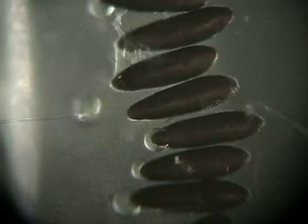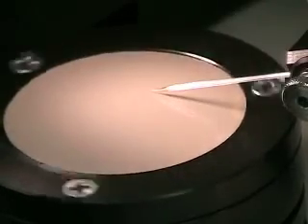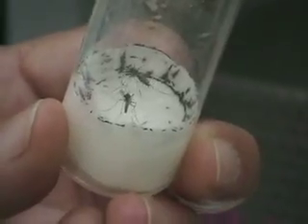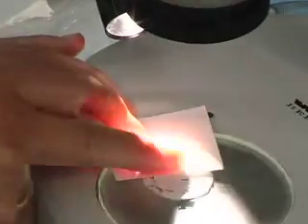I have just shown you how to do microinjection into Aedes aegypti embryos. Three steps are very important in this procedure: you have to make very good needles, you have to pick up embryos at the right stage, and desiccation has to be done very precisely — not too much. In about four weeks we will have transgenic mosquitoes.